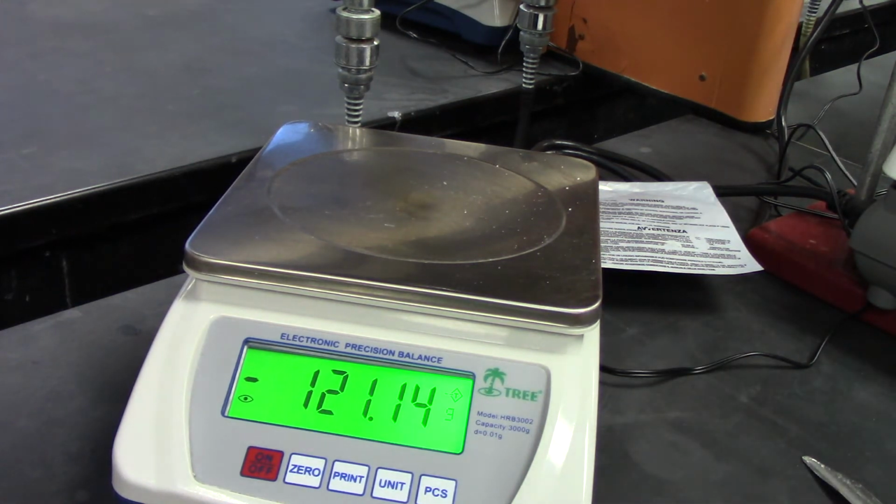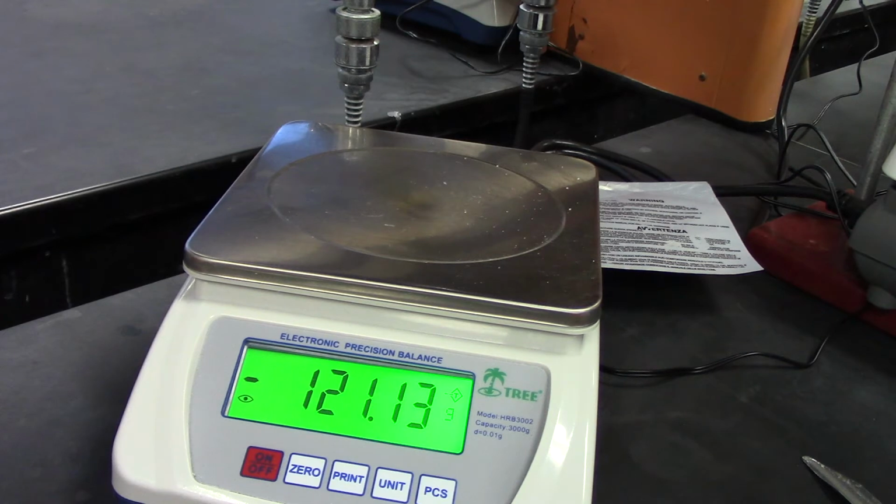I'm going to fill up my burette again with sodium hydroxide. The amount of sodium hydroxide here is 0.30. That's how much we're going to start out with, 0.30. Make sure you write that down.